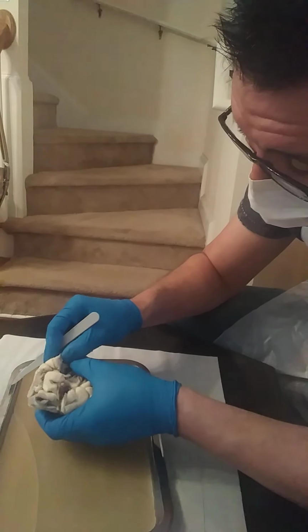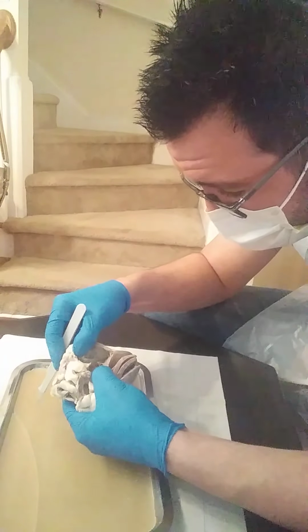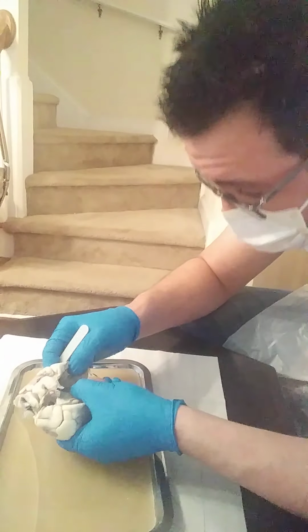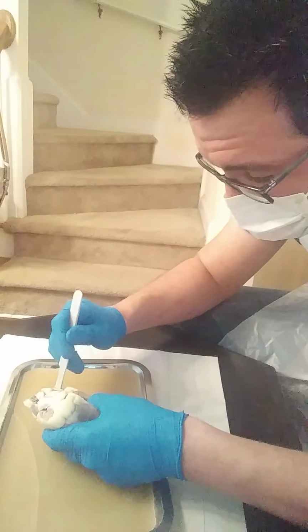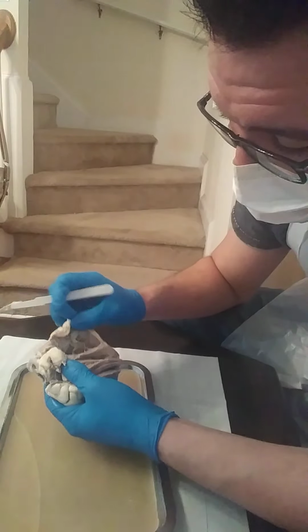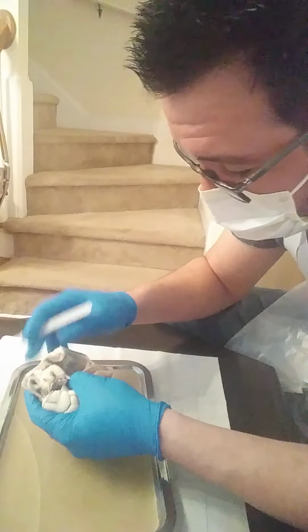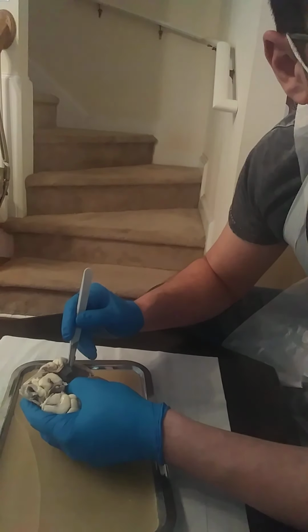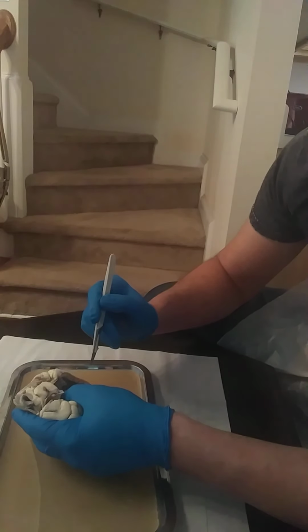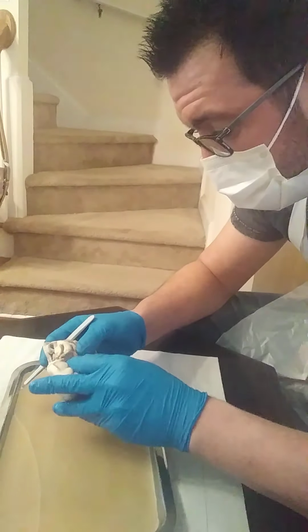Well, here's the inside of the left ventricle, and I'm looking around for, there it is. And there is the bicuspid valve. I just don't know how I could show you without cutting it open any more. But here we are, so let's cut it open more. There it is, the bicuspid valve, and it has the mitral valves, the bicuspid valves. And I do believe that is everything that is supposed to be covered for the experiment.